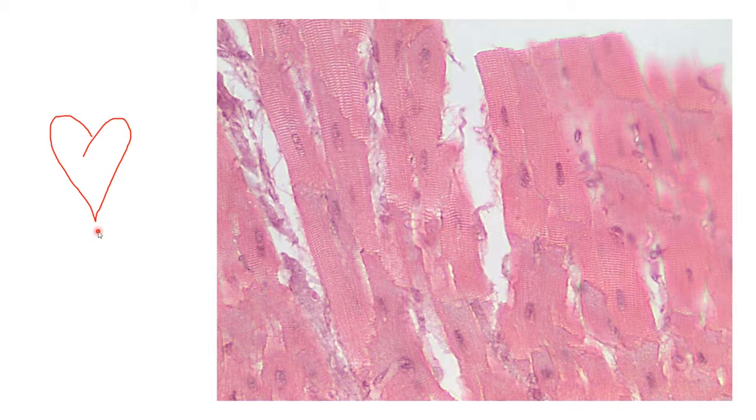How do we recognize cardiac muscle tissue? First thing that we need to look for is those stripes again. I still see those stripes. So my options are either this is skeletal muscle tissue or cardiac muscle tissue. The way I know that this is cardiac muscle tissue is see these little jagged lines right here between this cell, and I've got some more jagged lines right here, some more lines in between these cells. So these lines that you're seeing here, I'll type it in our chat. These lines are what we call intercalated discs.